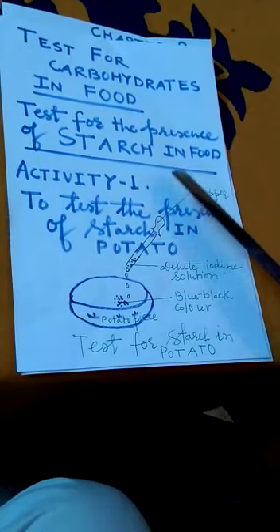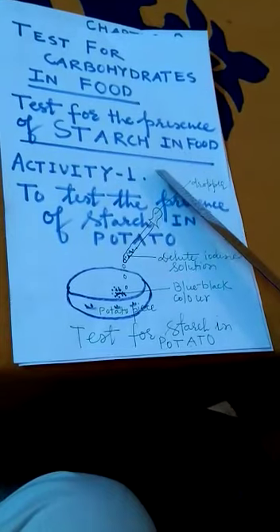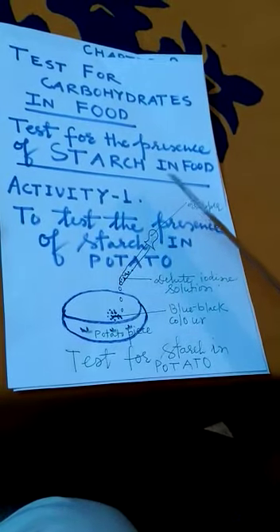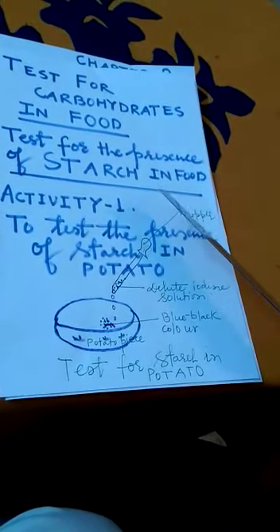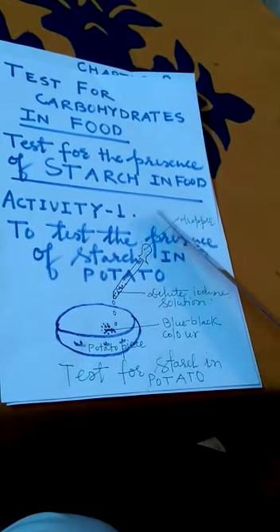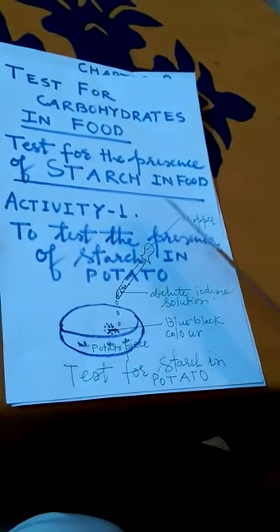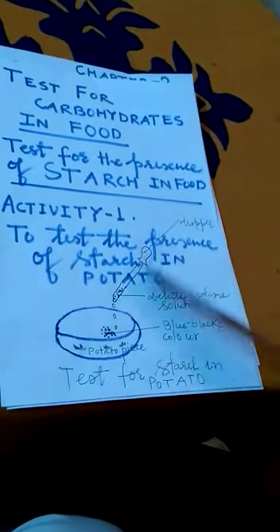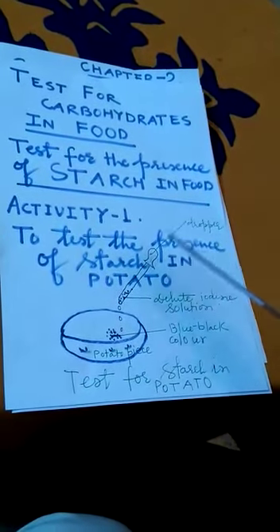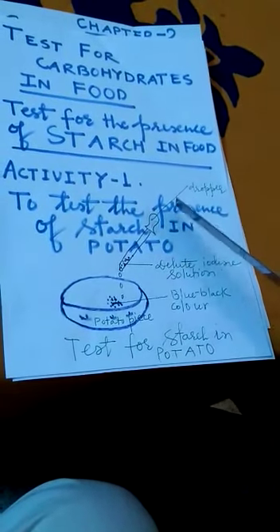So what should we do to test for starch? First, we should take the food to be tested and add 2 or 3 drops of dilute iodine solution to the food with a dropper. If a blue-black color is produced, then starch is present in the given food. The test for starch will now become clear from the following activities, in which we will use potato and flour as the food items for testing starch.